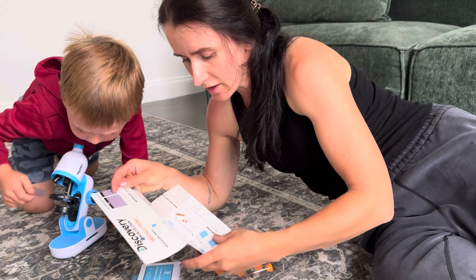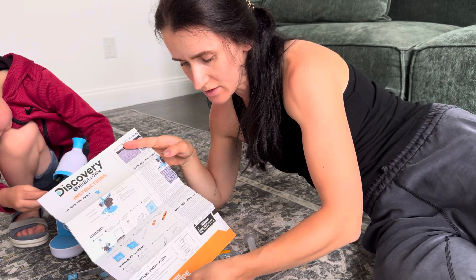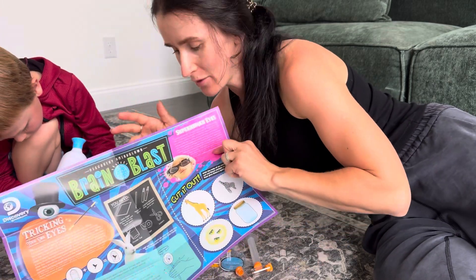Guys, we really like this microscope — it is pretty easy to use and comes with all the amazing instructions and accessories. So definitely check it out. It is great for kids, amazing product.